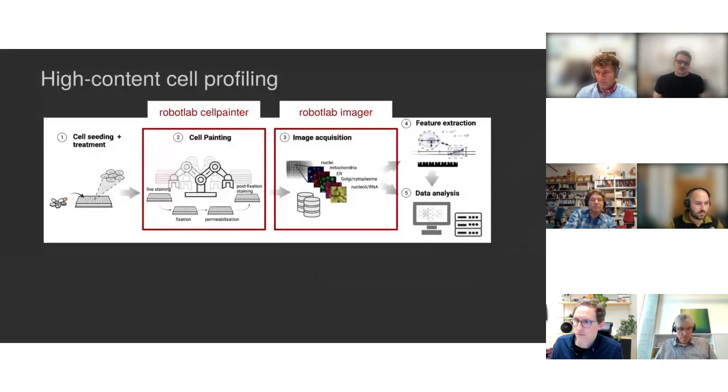So I'll just say a little bit more about the different kinds of components that build this.